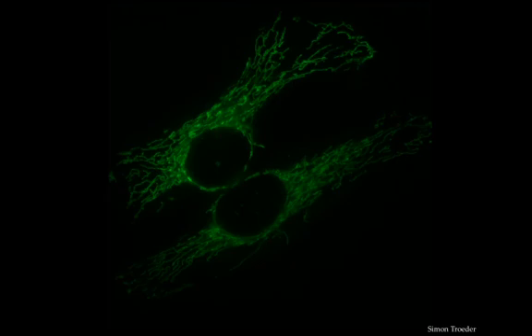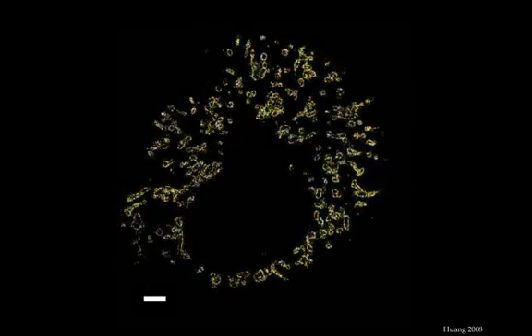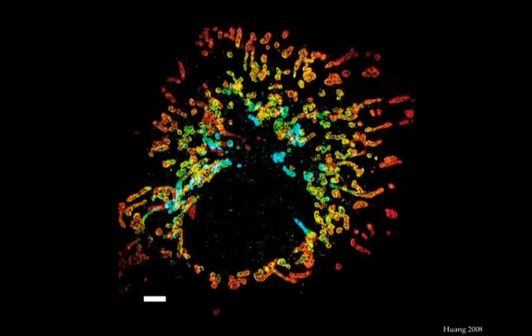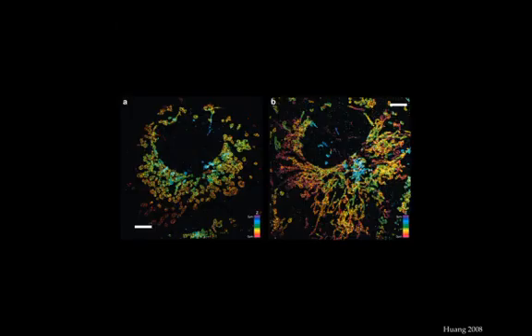In order to overcome this, Huang used 3D STORM localization to investigate the structure of the mitochondrial network in monkey cells. They imaged the mitochondrial outer membrane by staining TOM20, a translocase that's enriched there. This STORM movie shows the reconstruction of the volume. And immediately, a few things are visible. In particular, the hollow space enclosed by the outer membrane.